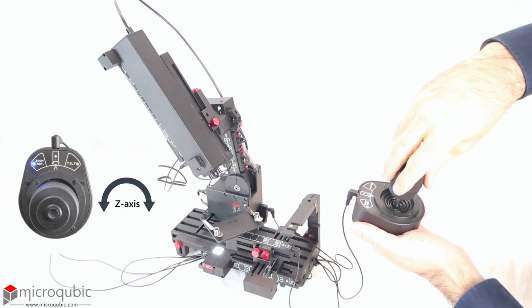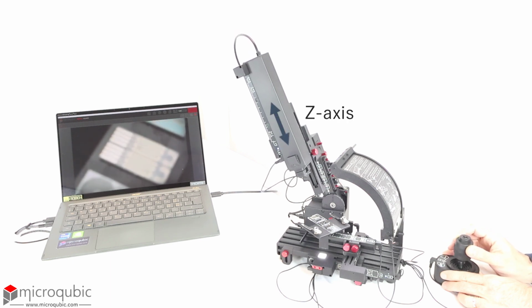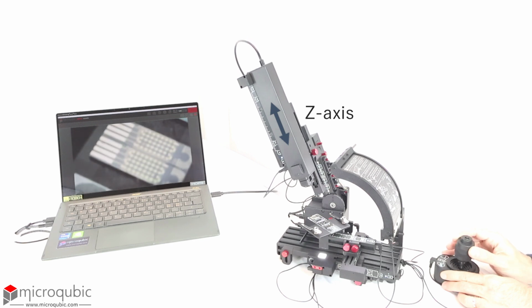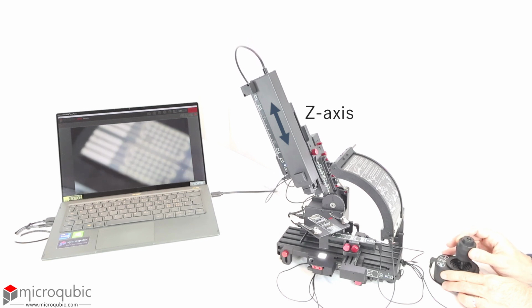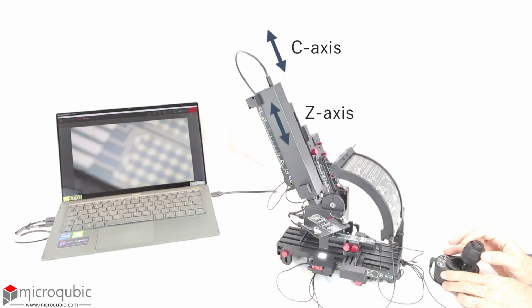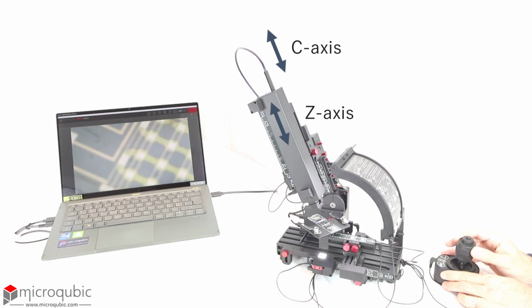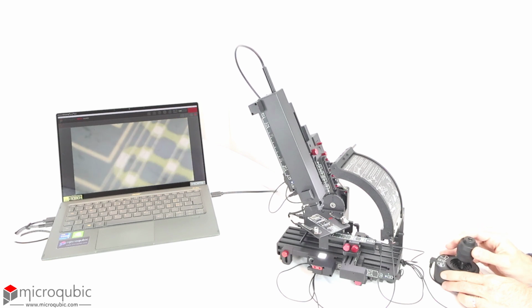precise positioning. The zooming is done by moving the whole camera module closer to the sample using the Z-axis, while moving the CMOS image sensor inside the housing away from the objective lens using the C-axis, and just the opposite to zoom out. Note that this microscope does not have a continuous zoom function, so both C and Z actuators must be adjusted to keep the sample in focus for different zoom levels.